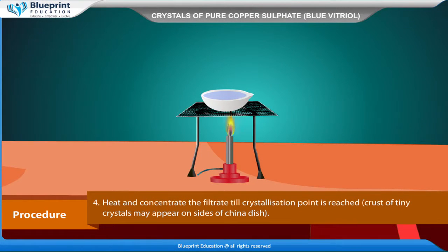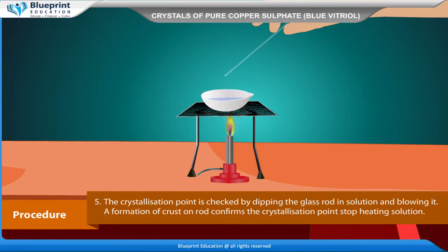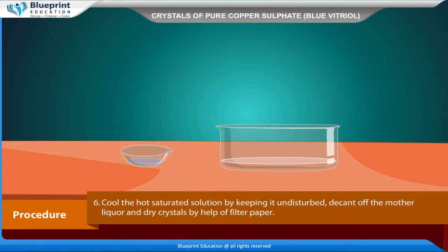Heat and concentrate the filtrate until the crystallization point is reached. A crust of tiny crystals may appear on the sides of the china dish. The crystallization point is checked by dipping the glass rod in the solution and blowing it — a formation of crust on the rod confirms the crystallization point. Stop heating the solution. Cool the hot saturated solution by keeping it undisturbed.